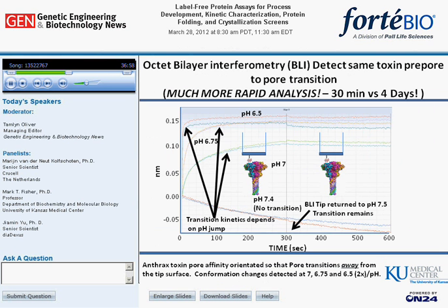Both to our surprise and delight, we demonstrated that we could also view this very same type of conformational change using the ForteBio Octet or BLItz biosensor systems. In this instance, not only were we able to observe this conformational transition, we were also able to simultaneously view this transition at a series of pH conditions in duplicate.